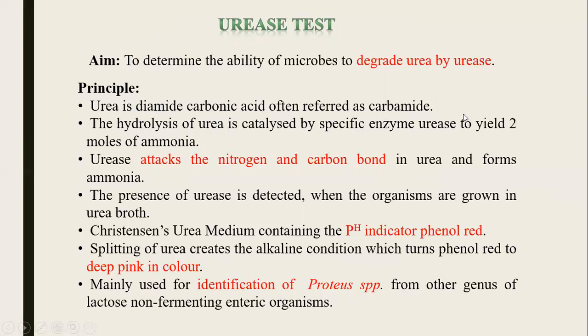This is detected by inoculating the test organism in Christensen's urea medium, and this medium contains the pH indicator phenol red.